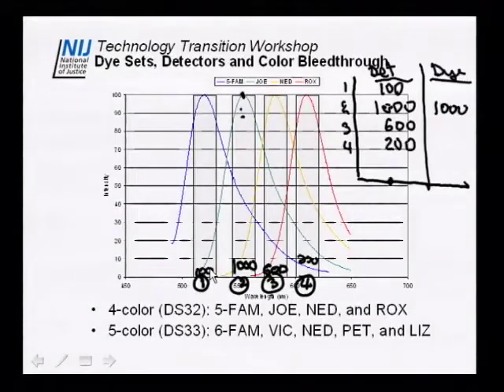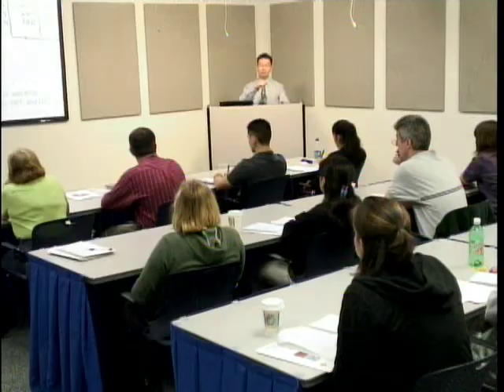What you have at the end of this is called detector space. What you really want is the dye space, and that is when you make the transformation from detector to dye, you want it to say detector 2, which in dye space is green, will have 1,000 counts. Detector 1, which in dye space is blue, will have 0 counts. Detector 3, which is yellow, should have 0 counts, and detector 4, which is red, will have 0 counts. And from a graphical perspective, what this looks like is the color-corrected trace that you get on the instruments when you start off with your raw data and you see, oh, 1 red peak or 1 green peak with no pull-up associated with it. So how do we get from detector space to dye space?